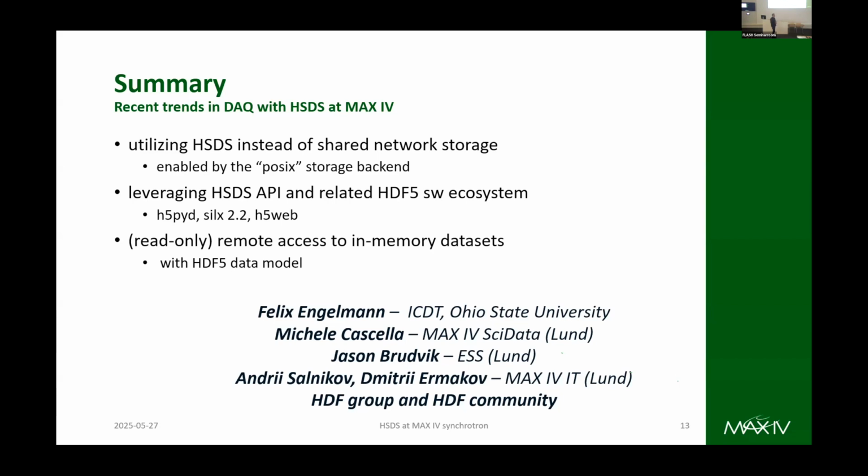But that would be too much. If we were updating the images on the visualization 120 times per second, we would completely overkill the computer. And the images are large, like 4,000 by 4,000. So the resolution is giant, and this means that honestly it is running at 1 hertz, because that's the capability of a computer with a 1 gigabit connection to get data without compression and with optimization. You run into network limits.